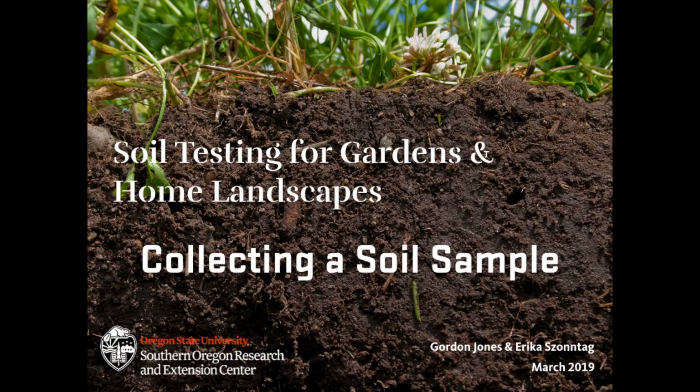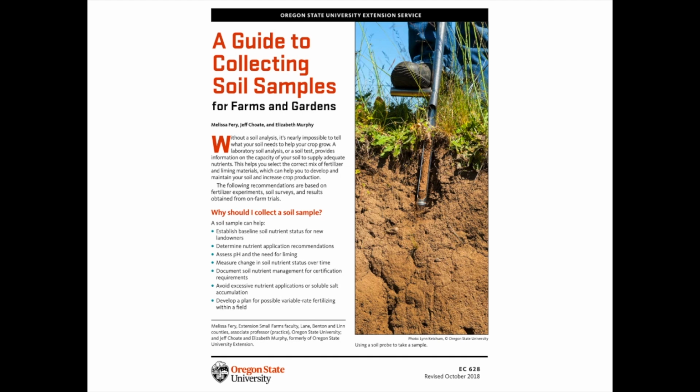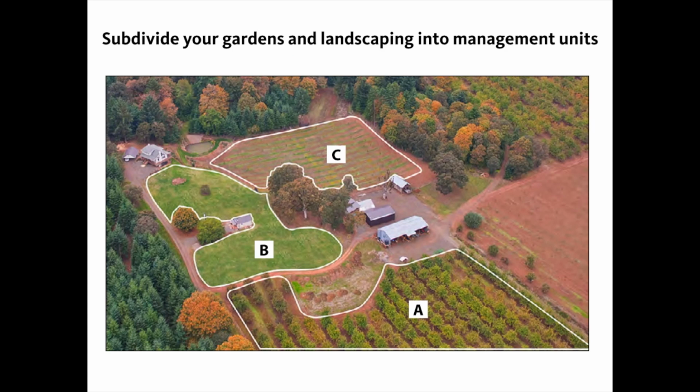Welcome to the preliminary instructions for how to collect a soil sample. Please refer to this guide attached to your email for further details. Divide your property into management units, for example, lawns, beds, or orchards, and for purposes of this class, collect samples from one management unit only.